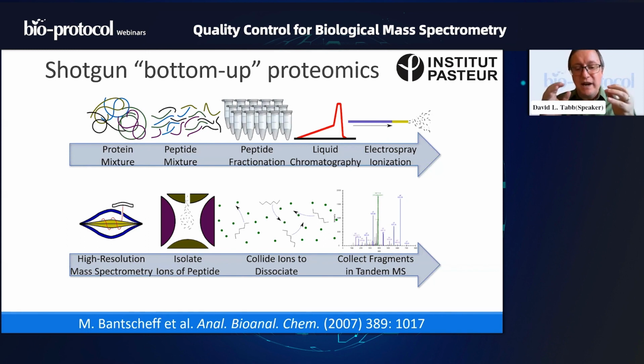They are able to separate this mixture of 100,000 peptides into fractions that contain far fewer numbers of distinct peptides in each. So we need to combine together all of those fractions in order to account for the total content of the proteome. Each of those peptide fractions, each of the little Eppendorf tubes I've shown here, will then be subjected to liquid chromatography, usually at acidic pH, which is to separate those peptides on the basis of hydrophobicity.